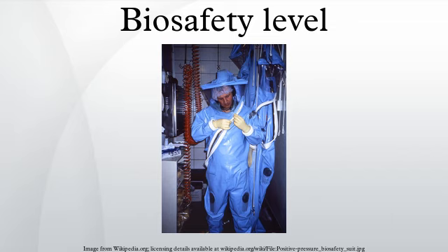See biological hazard. At the lowest level of biocontainment, the containment zone may only be a chemical fume hood. At the highest level, the containment involves isolation of an organism by means of building systems, sealed rooms, sealed containers, positive pressure personal suits and elaborate procedures for entering the room, and decontamination procedures for leaving the room. In most cases this also includes high levels of security for access to the facility, ensuring that only authorized personnel may be admitted to any area that may have some effect on the quality of the containment zone. This is considered a hot zone.